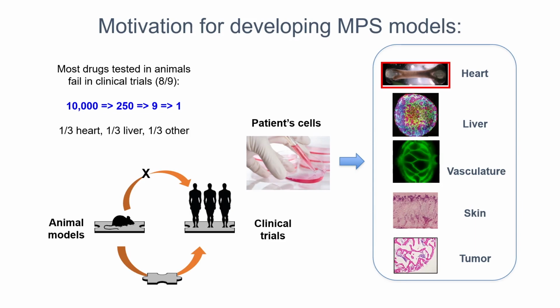10 years ago, the federal agencies played a major role in really launching this field by posing a question to the scientific and clinical community. Can we utilize the knowledge that we have gained over the years in the field of tissue engineering and stem cell biology to make models of human tissues that will help us bridge from discovery into the clinical studies? This transition had been made over many years by using either simple human cell cultures or animal models.